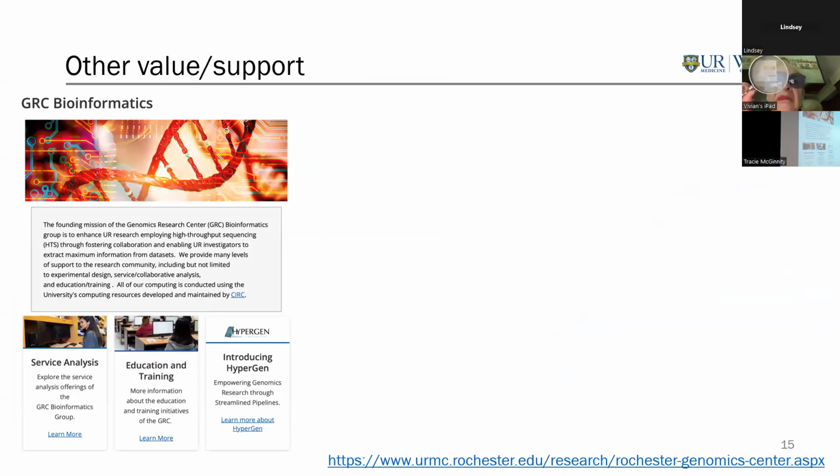Other things that might be important to you: I mentioned the bioinformatics folks. We have a webpage with a lot of helpful information, including what the standard analysis is. Anything that comes through the genomics core here, we usually have some sort of primary analysis. We think that's important because we want you to be able to look at that really quickly and say, is my hypothesis validated or not? Did my experiment work? Is there an issue?